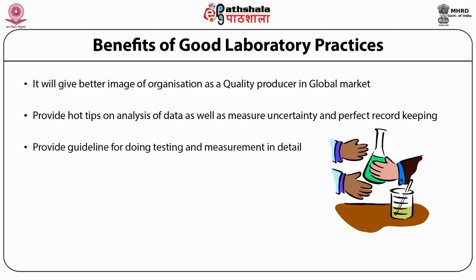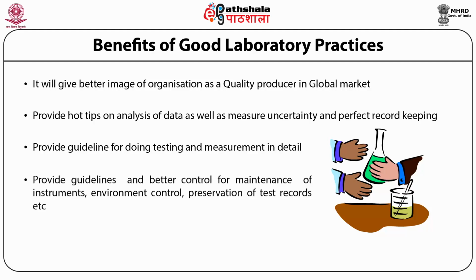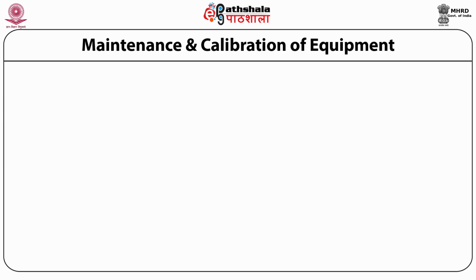It will provide guidelines for doing testing and measurements in detail with all the records documented, and that can be traceable anytime. It will provide guidelines and better control of maintenance of instruments, environment control, preservation of test records, etc. Maintenance and calibration of equipment.